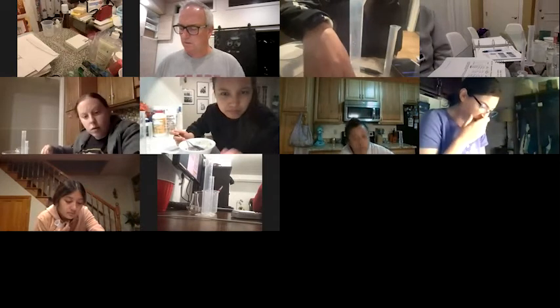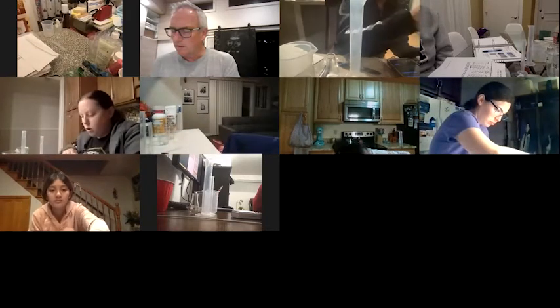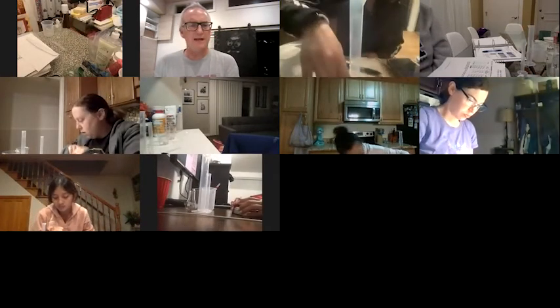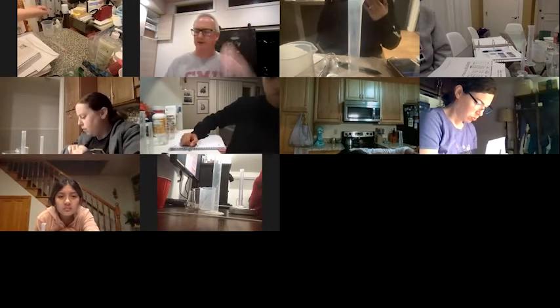What are you getting as a mass for your 10 ml cylinder? I get exactly 11.00 grams — wait, I got 12 grams. Just 12 grams with no decimal? That's going to be tricky to do the experiment without that kind of accuracy, but go ahead and plow ahead.